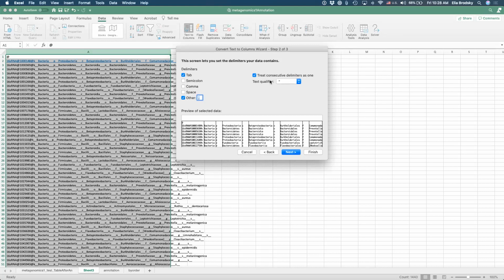Here what we want to do is just separate the title and the taxonomy. So let me know once you have done that, just so that I know I'm not losing anyone, because you will actually use this table to understand what's in there.